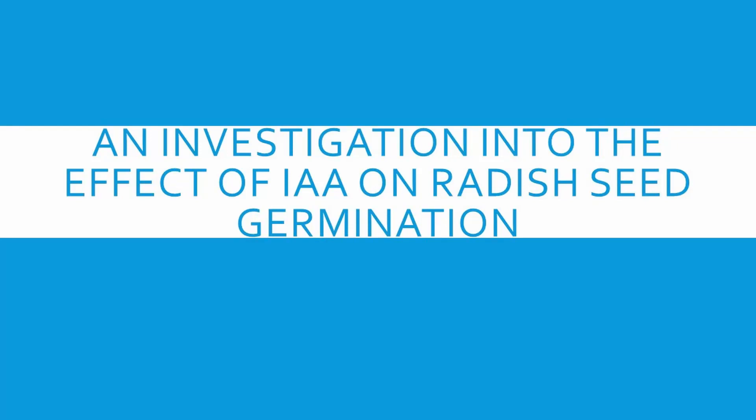In this experiment, we're going to be looking at the effect of IAA concentration on radish seed germination. The very first thing we're going to do is set up our control so it's done and out of the way.